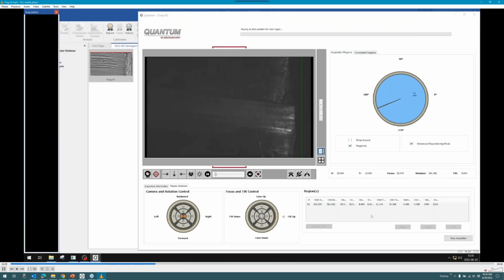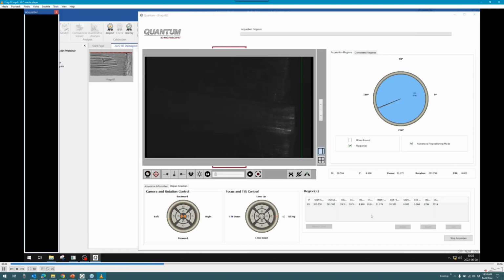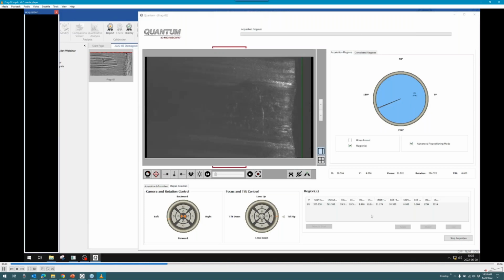That is because this surface is in fact damaged and deformed to the point where it is no longer anywhere near cylindrical. It's got a reverse curve to it that we'll see more closely in detail at the validation screen.